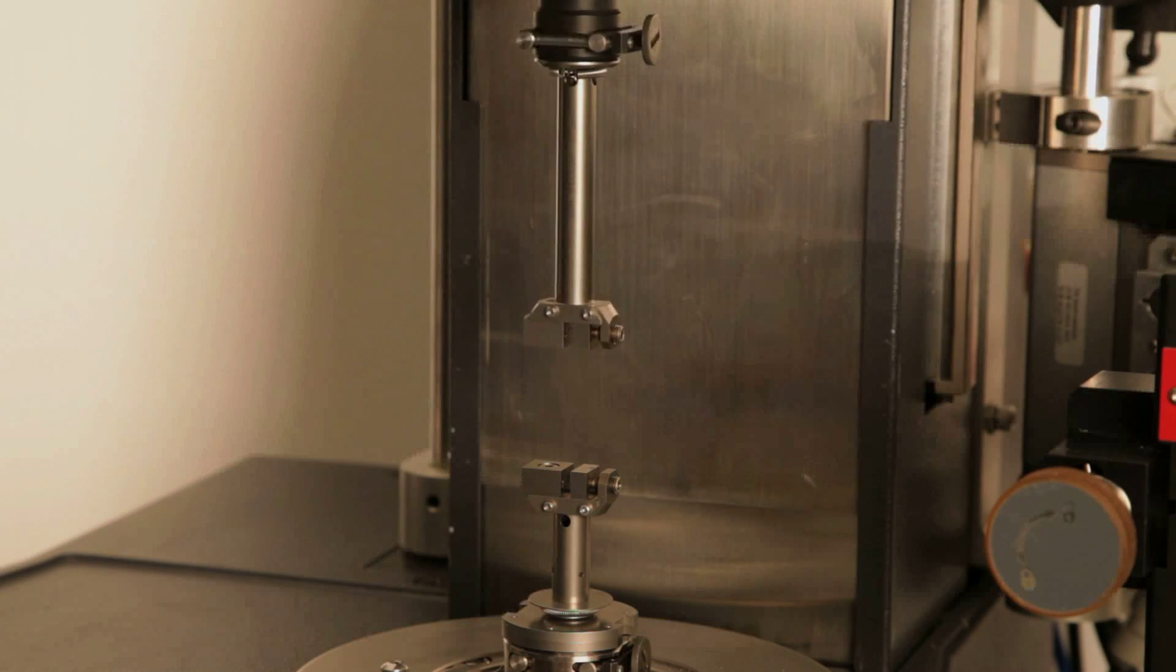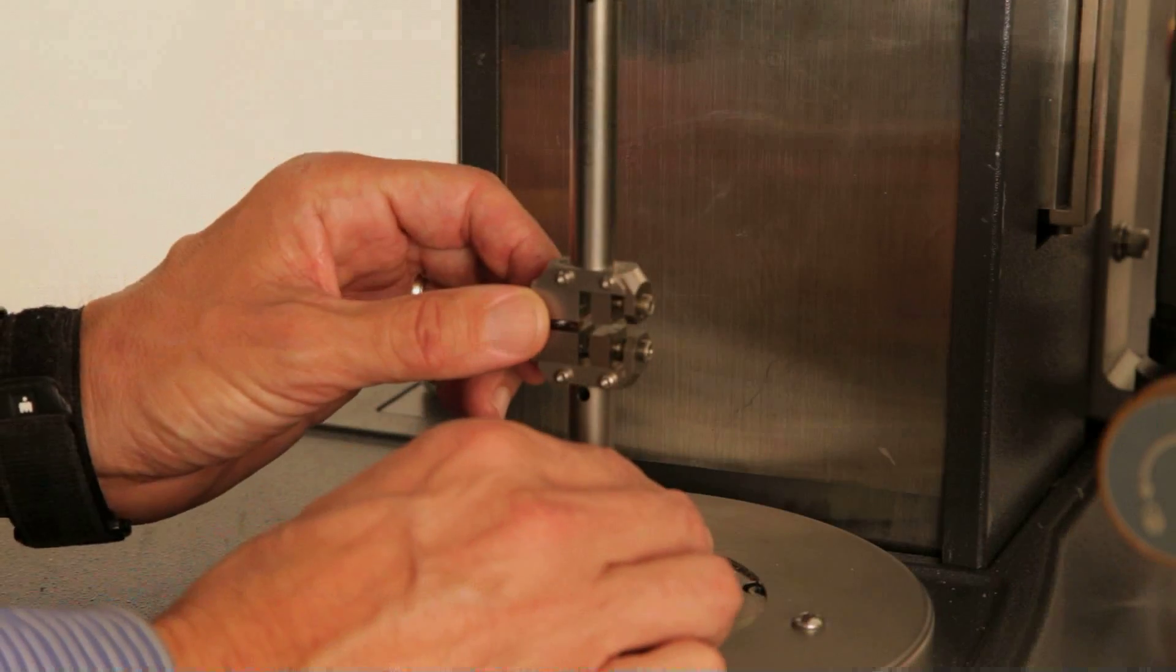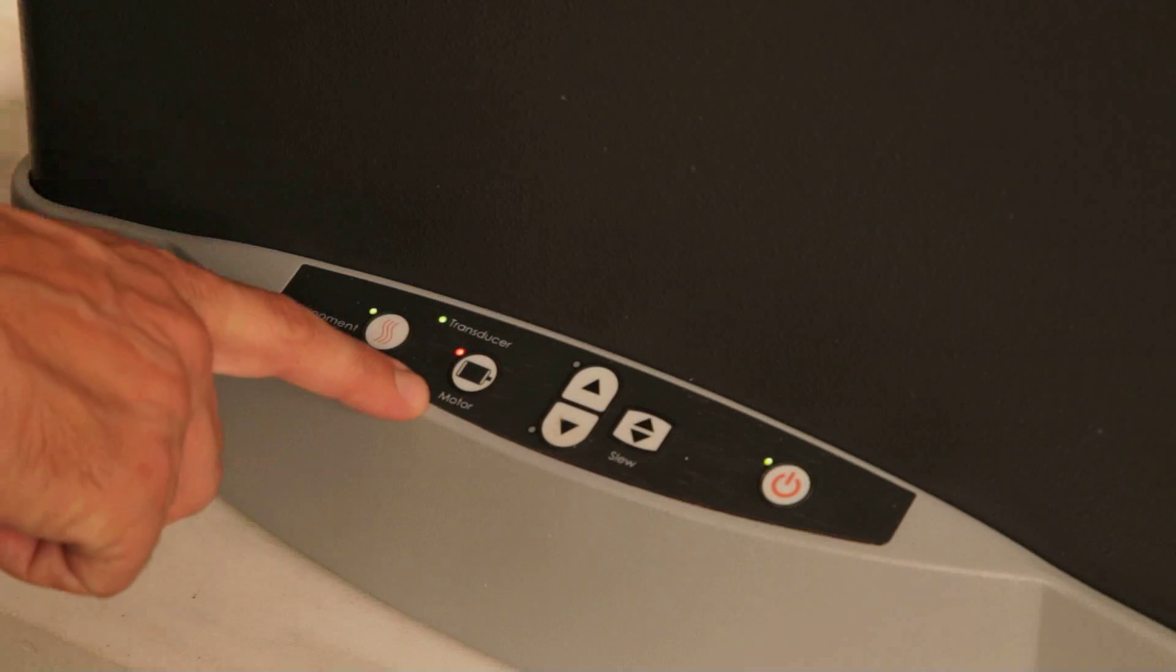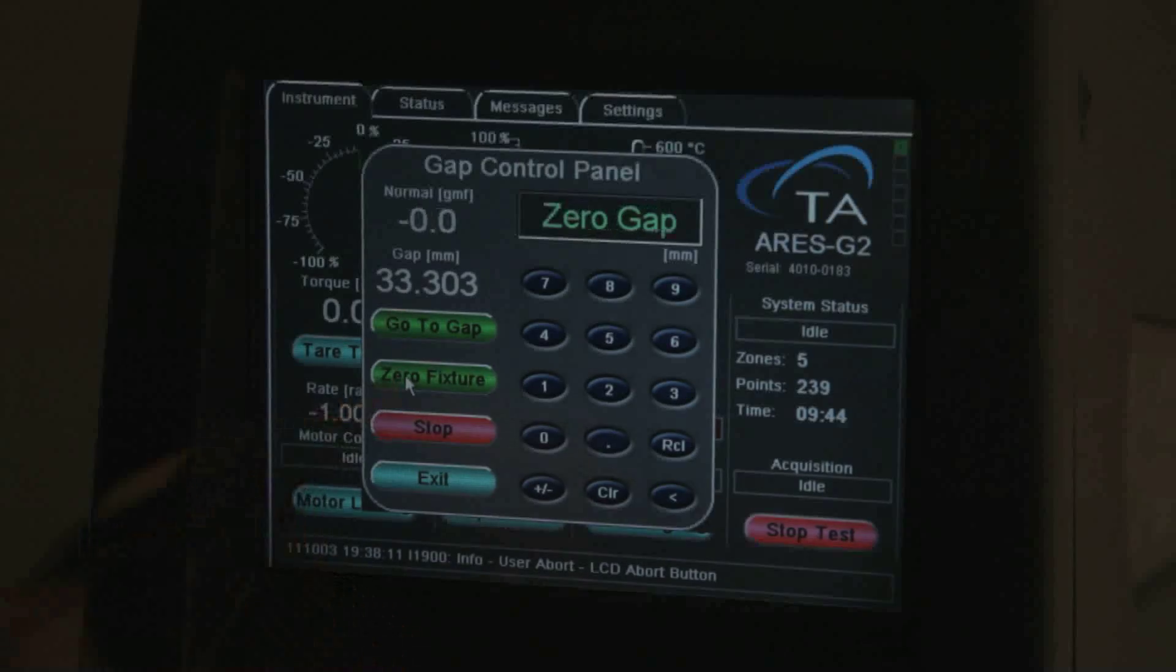Now, bring the upper tool down to about one millimeter from the lower tool. Align the tools using the motor on-off switch on the lower touchpad, and then choose zero gap from the touch screen.